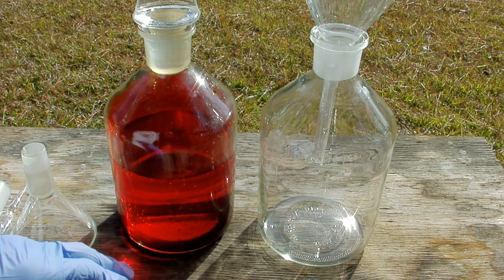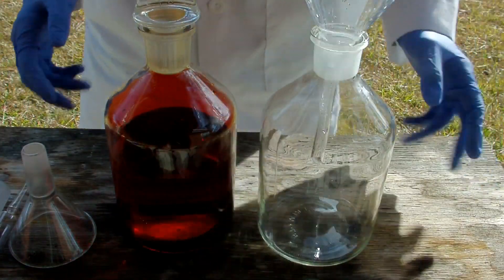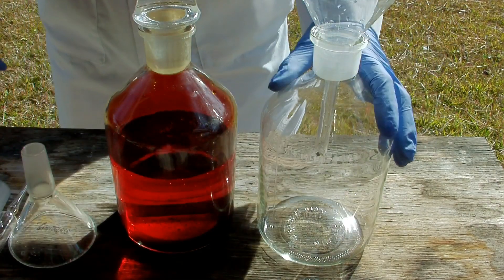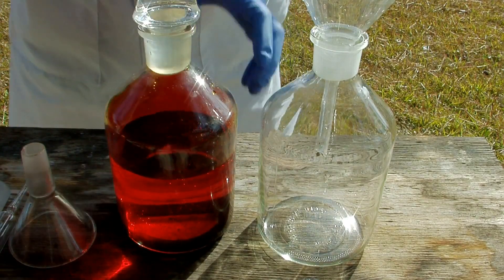I've let the bromine solution sit overnight and you can see it's settled out really nicely. It's a clear solution and on the bottom you can very clearly see elemental bromine sloshing around. Now we need to separate that using a sep funnel. Before I put it into the sep funnel I'm going to pour off the majority of this liquid. I've got my lab coat and gloves on because at this step you definitely don't want to get any of this on you. Of course I'm using all glass apparatus again because bromine attacks plastic.